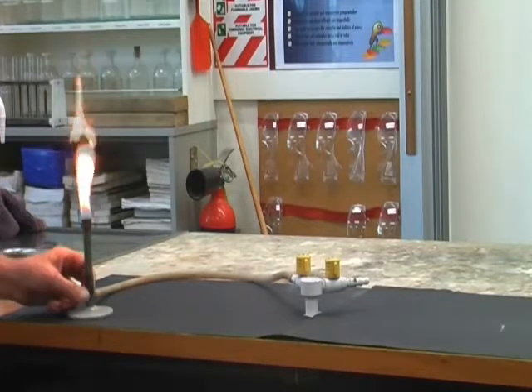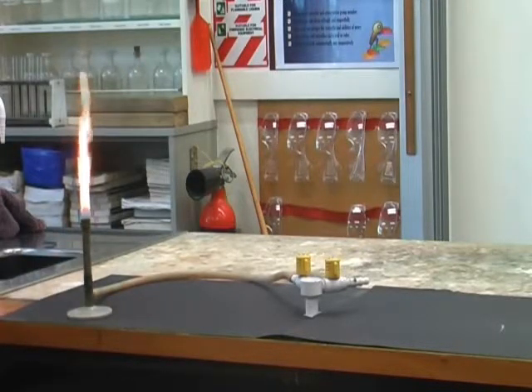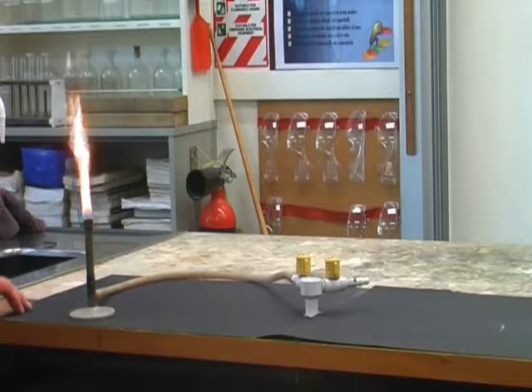This particular thing is burning propane, which is the general heating in most laboratories. It's a smallish molecule with just 3 carbon atoms. Unfortunately, we don't have access in the labs to the 2 smaller ones, which would be called ethane and methane. But we do have some others that are part of this series. And this series of compounds are chemically not very interesting.